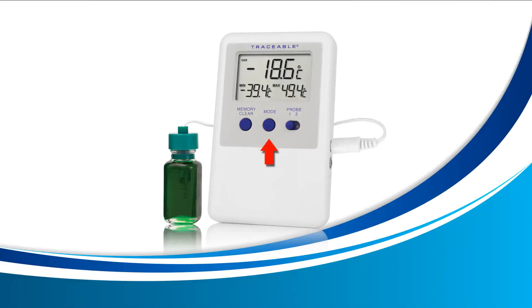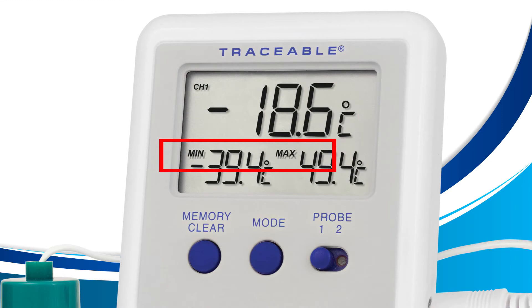Viewing your min and max temperature. Start by locating the mode button on the center of your device — this will be the only button we'll be using for this tutorial. Press the mode button until your screen displays the words 'min' and 'max' as shown here. Once you see min and max on your device, you're all done — you're now viewing the min and max on your device.